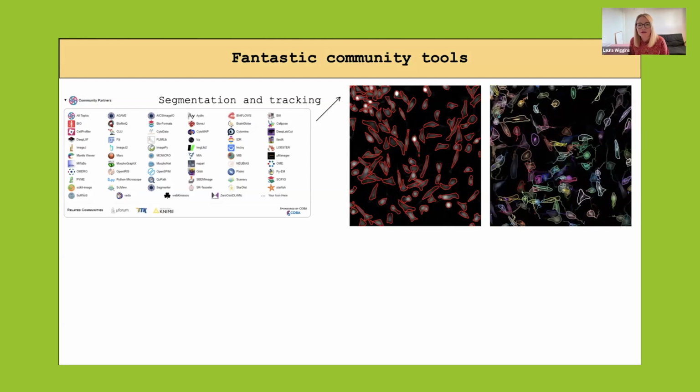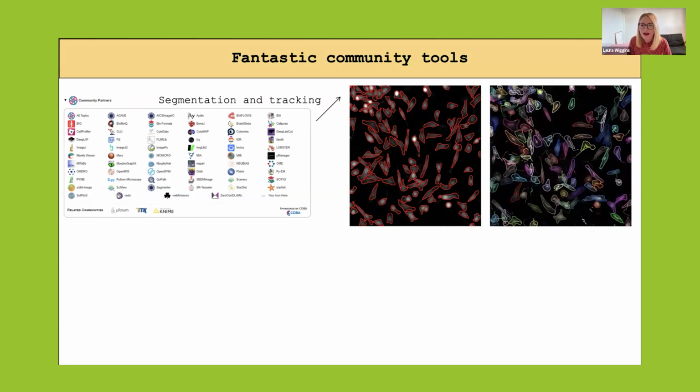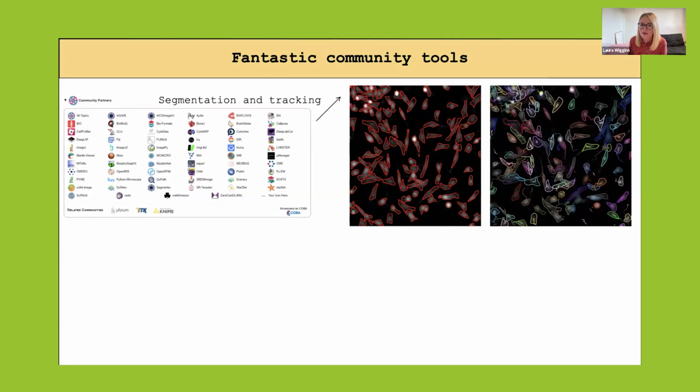So what we wanted to do was develop a tool that uses segmentation and tracking as an input for what we want to do. And that means that hopefully, to be able to use our tool, which is Selfy, you can use any segmentation and tracking software that is suitable for your own application and use those as input for Selfy.